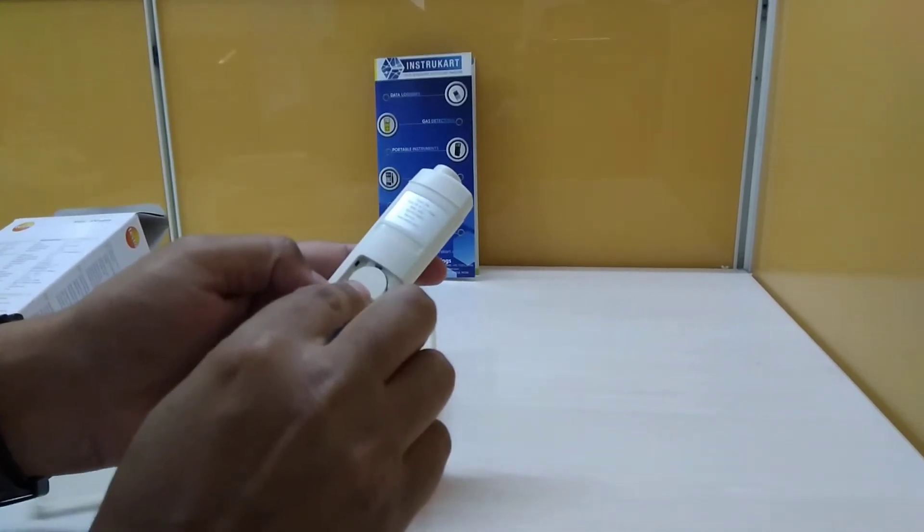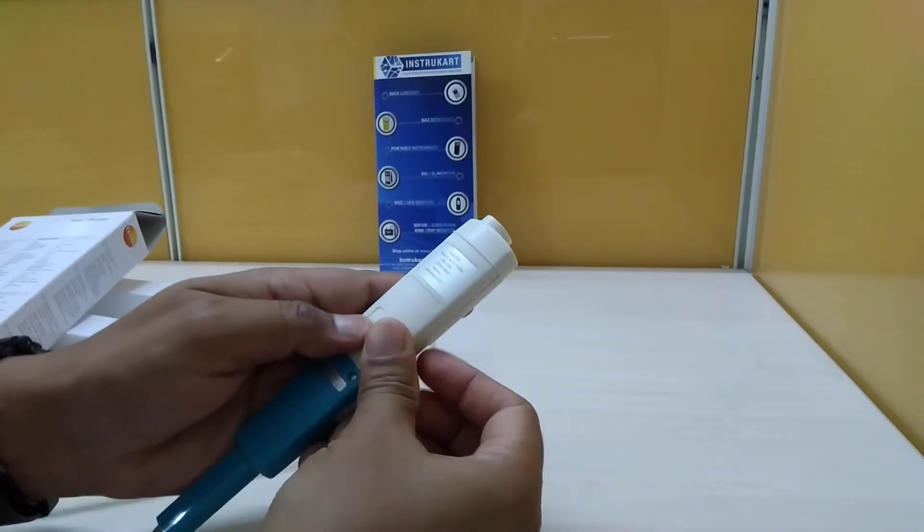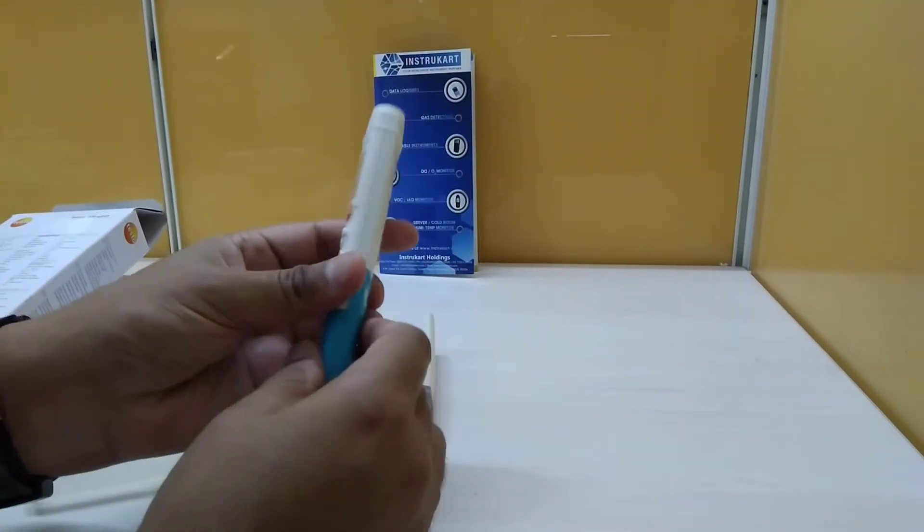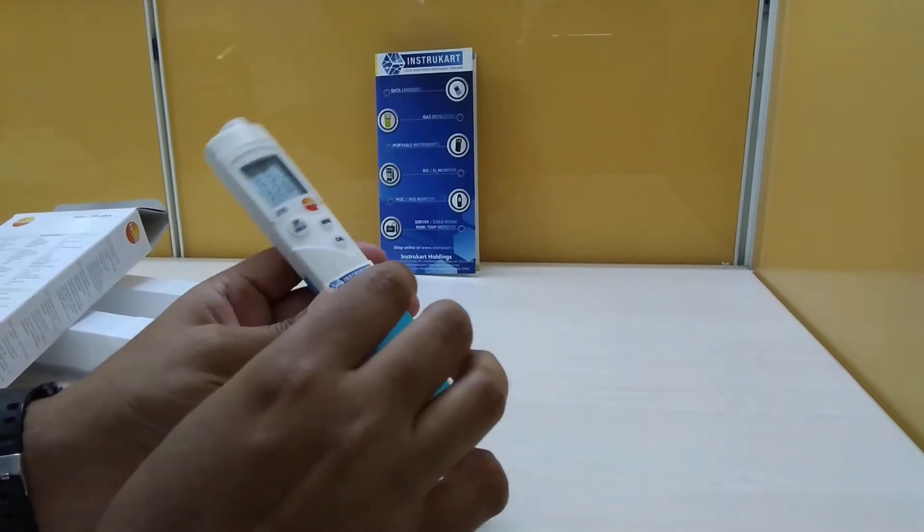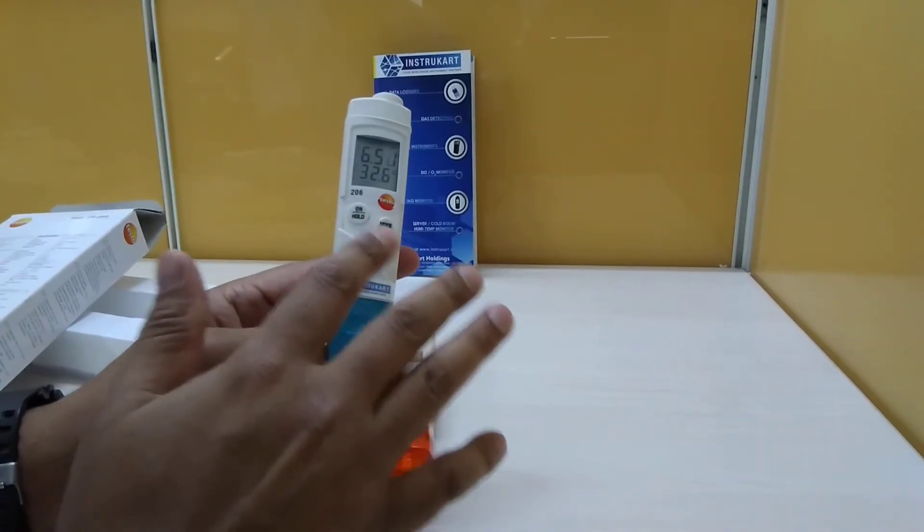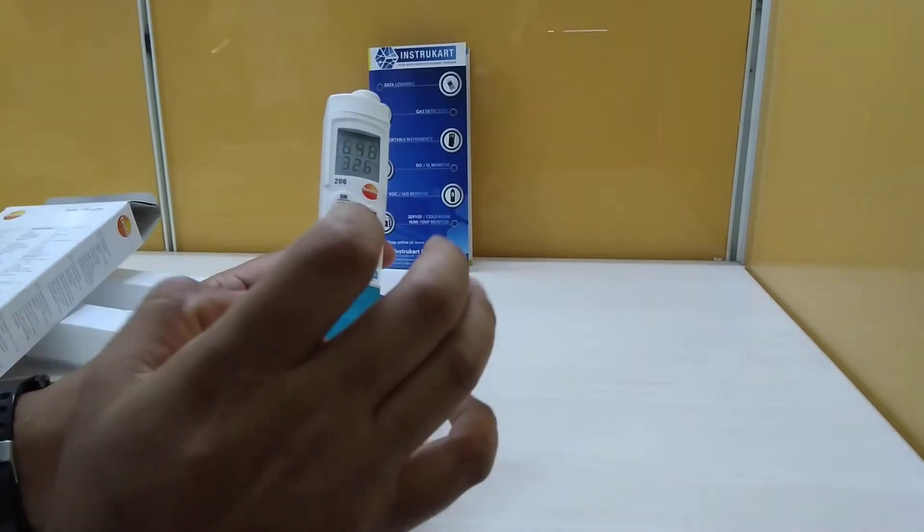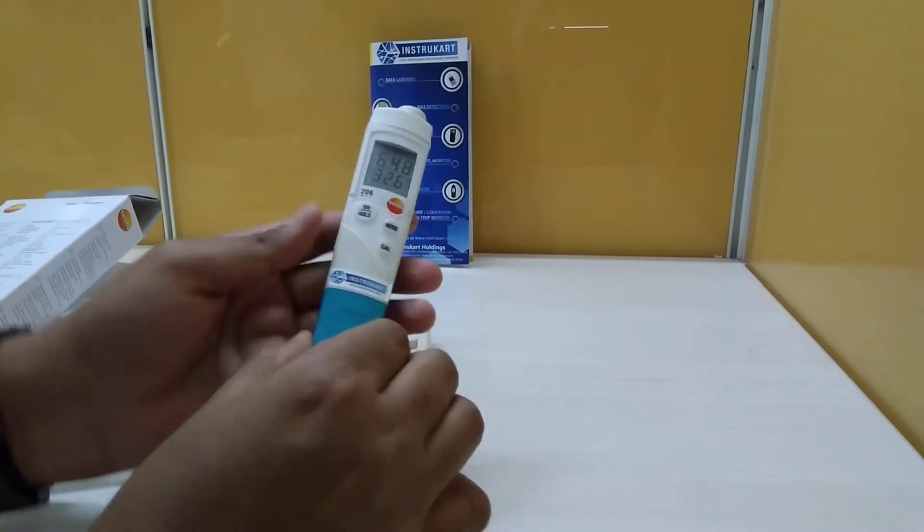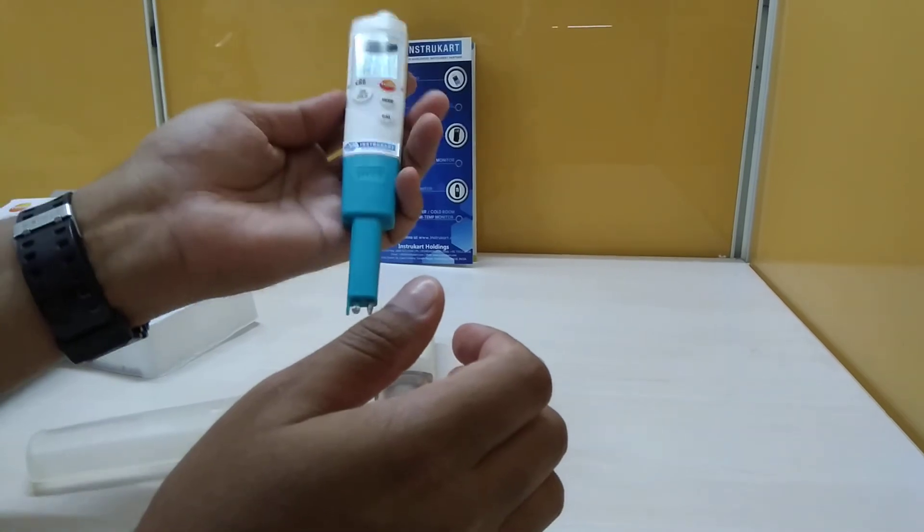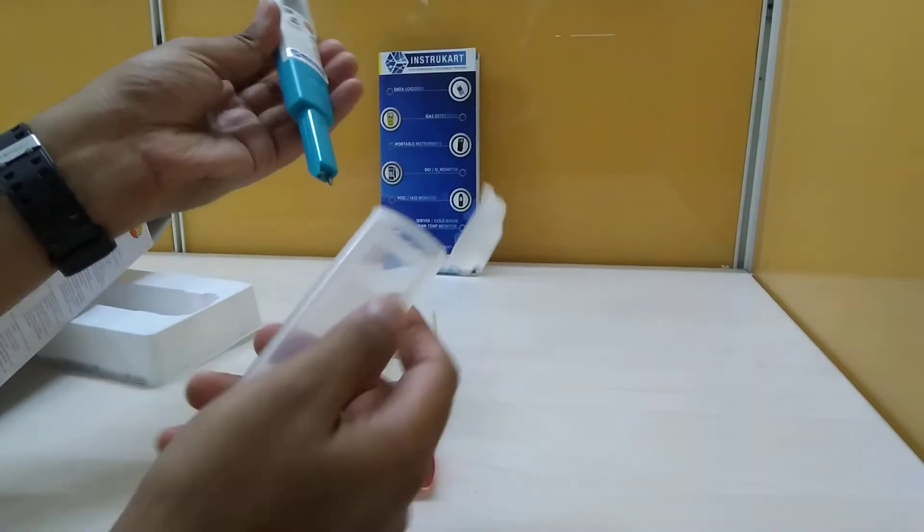The battery can be inserted from here and has a life of 80 hours. The housing is ABS, and this is very handy - a 70 gram device. There are several protections given for this pH meter which you can see.